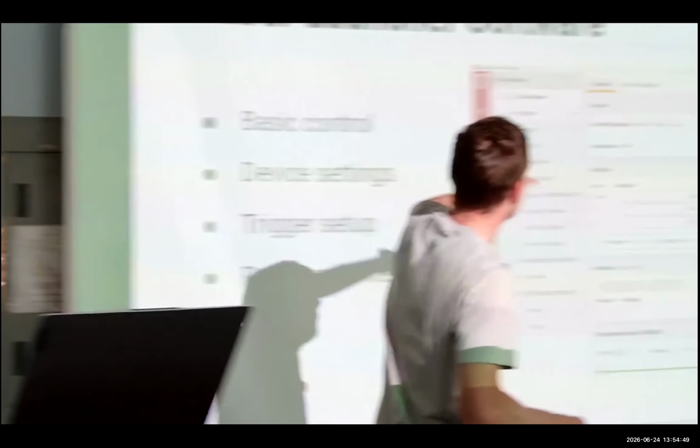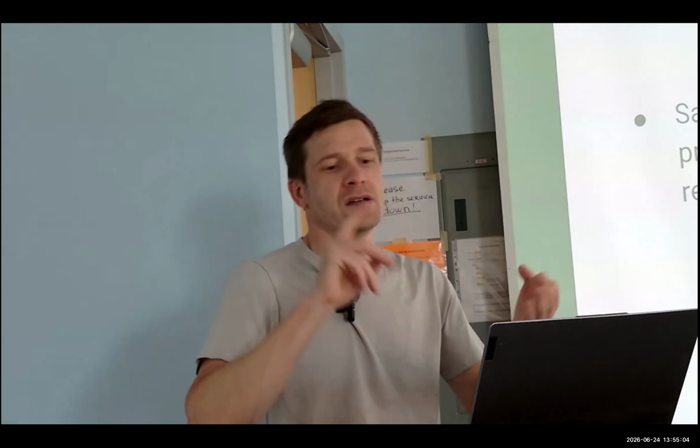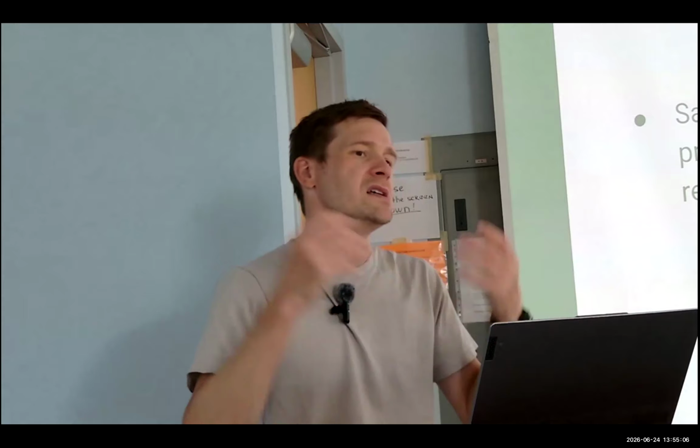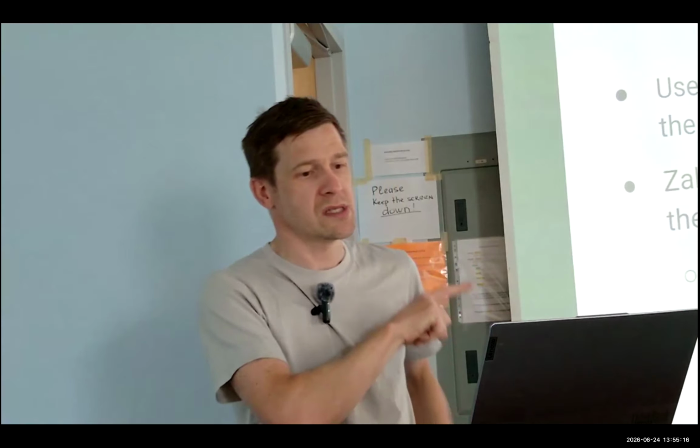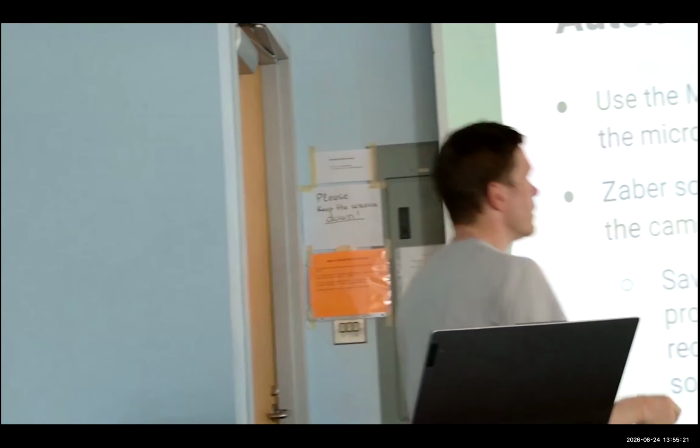Presets make life really easy. So there's this manage presets button up there. Presets basically let you build application or sample specific presets where you can set illumination, objectives, focus parameters, step sizes. You can basically build a collection of settings that you can apply with one click. So that's really handy. We use those as part of the automated multi-dimensional acquisition as well.